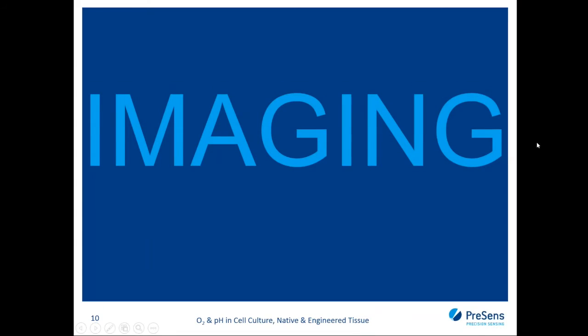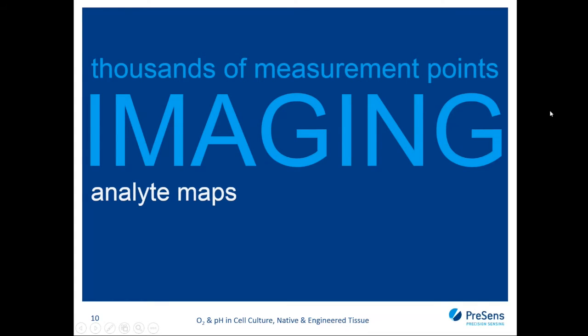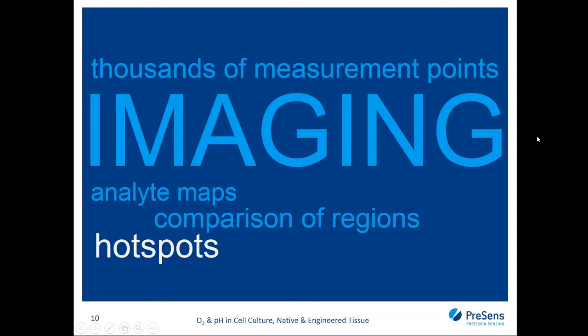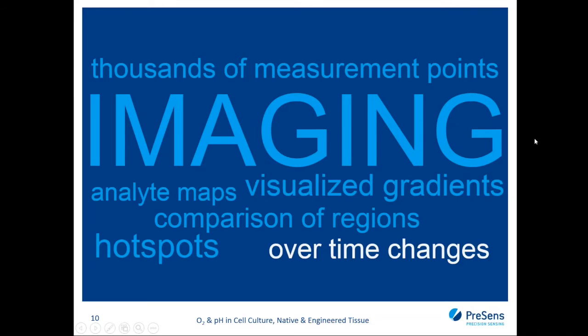Today's webinar is focused on imaging technologies. With imaging, you can generate thousands of measurement points at the same time by recording one image. So you can generate full analyte maps over your samples. You can compare different regions. You can detect hotspots and see where the action takes place in your sample and where the most severe metabolic processes go on. You can visualize gradients, which is pretty important, for example, in tissue engineering or in spheroid research.